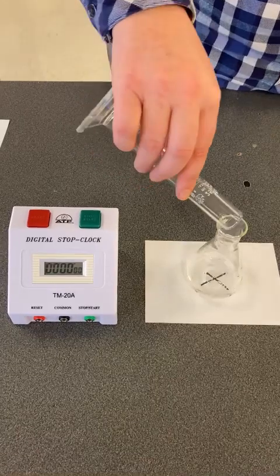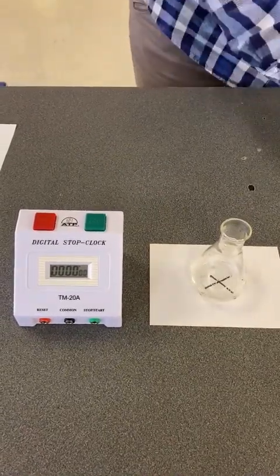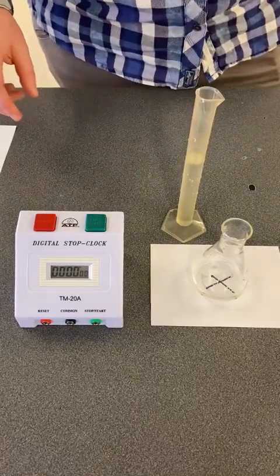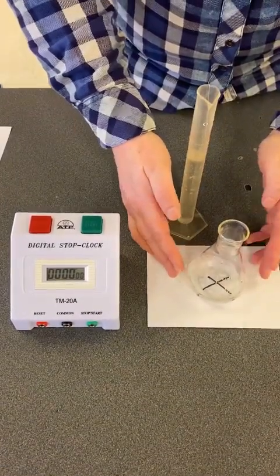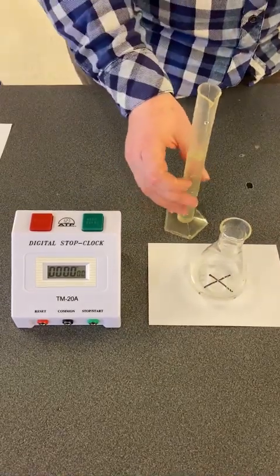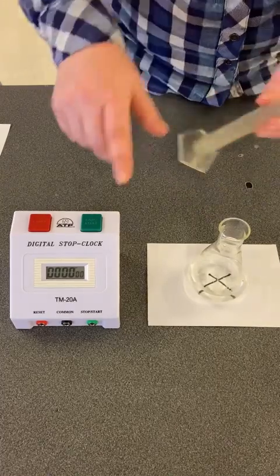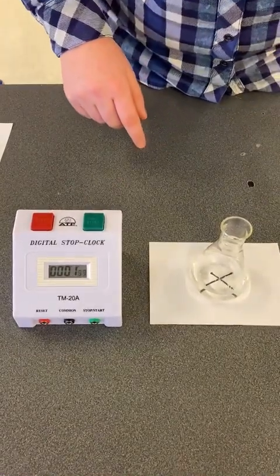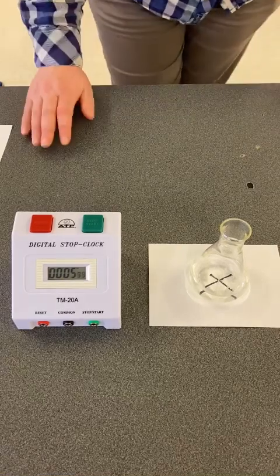I'm adding my 20 centimetre cubed of sodium thiosulfate. I've got my hydrochloric acid here. As soon as the hydrochloric acid enters the conical flask, I'm going to press start. You're going to see what happens in just 1 second. Now, the hydrochloric acid and the sodium thiosulfate are going to start reacting.